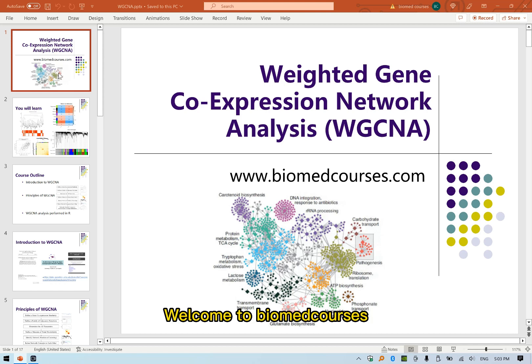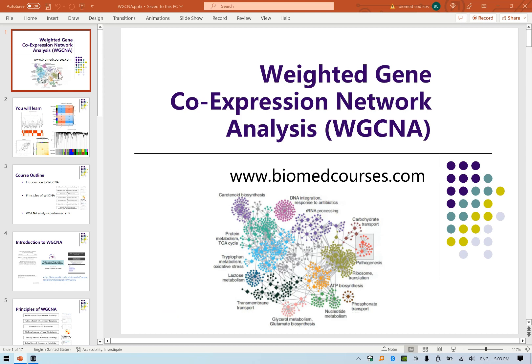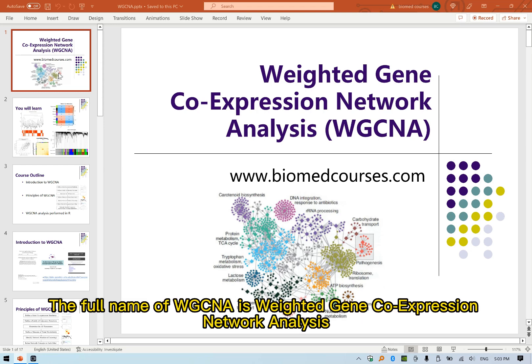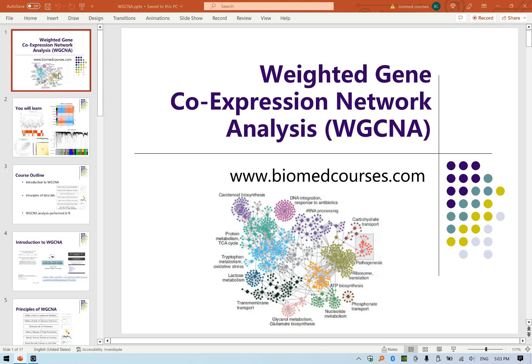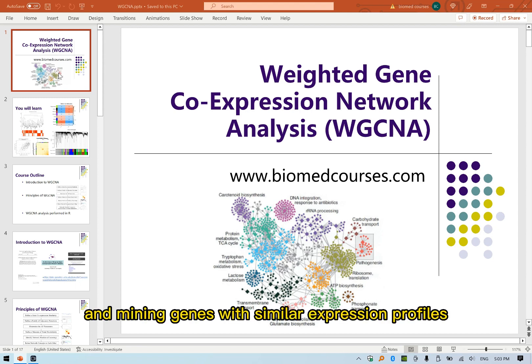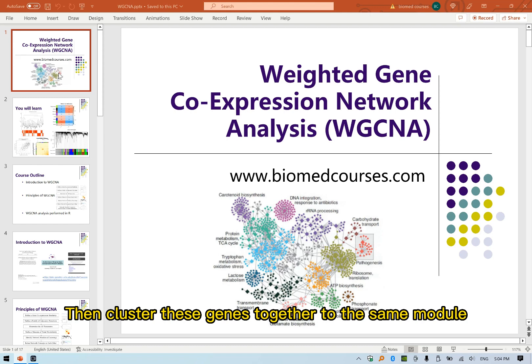Welcome to Biomed Courses. This time I will bring you the WGCNA analysis course. The full name of WGCNA is Weighted Gene Co-Expression Network Analysis. It is mainly used in analyzing gene expression data of a large sample size and mining genes with similar expression profiles, then clustering these genes together into the same module.